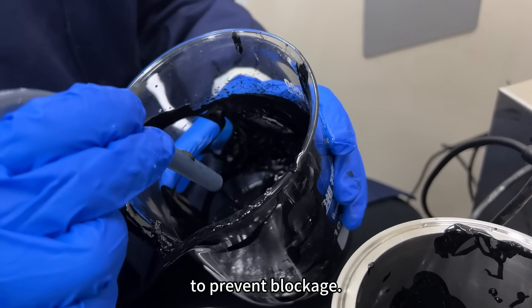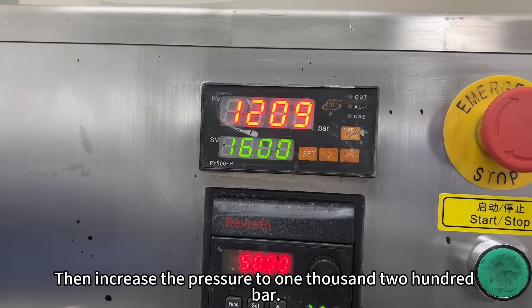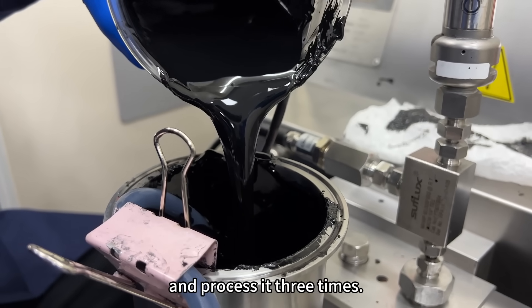To prevent blockage, we then increased the pressure to 1200 bar. The material was treated and processed three times.